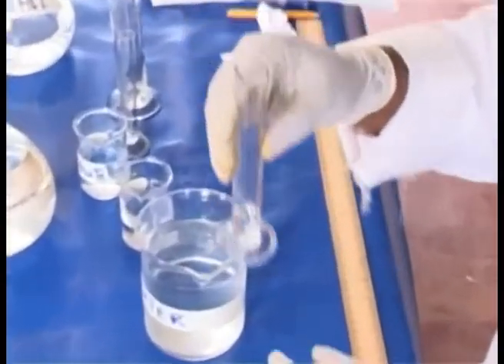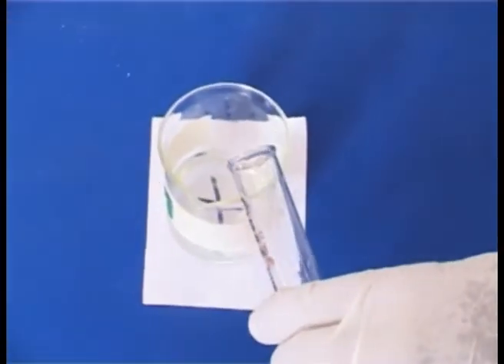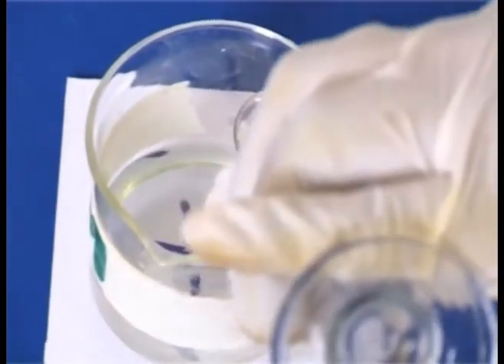This is 5 ml. Transfer 5 ml of distilled water into beaker M.